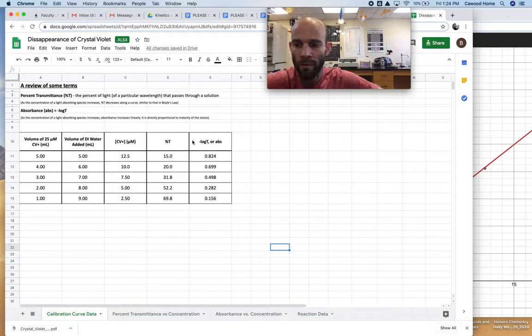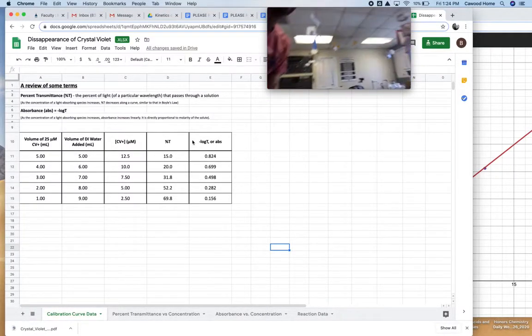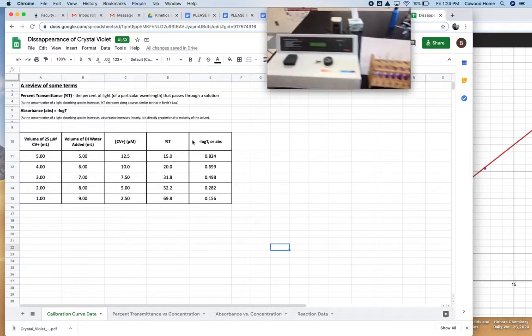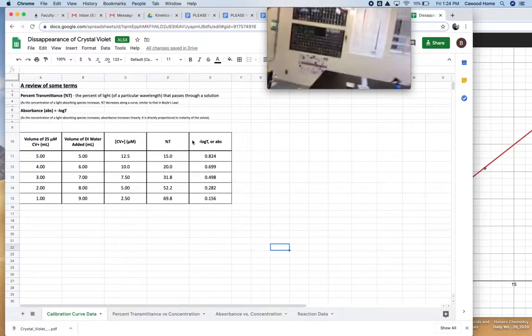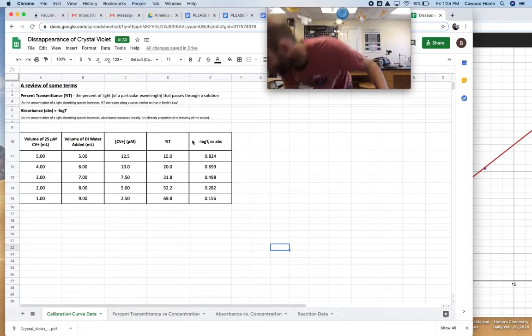If we go and have a look at the test tube where the reaction was happening, that's the one on the far right. It's getting a little bit more colorless, but the reaction's been going very, very slowly. I'm only up to about 28% transmittance. I don't know if you can read that dial there, but the reaction has been going very, very slowly. It's almost 130 right now.